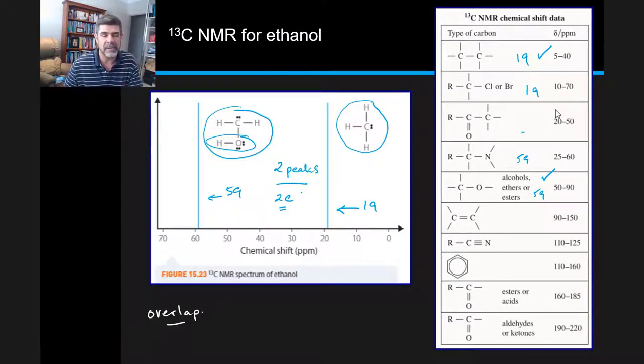And this is one of the things that's important when you look at it. The simplest thing to do is to see two peaks and say, well, it's got two carbons. It's a good starting point, but you'll still need other things to see if you can confirm what you think is the case.